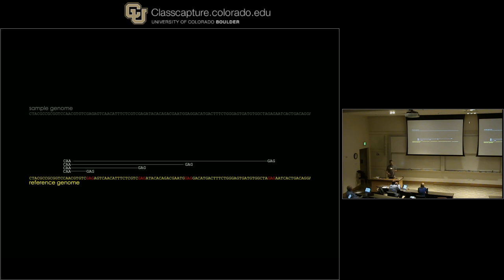And the way that our short-read aligners work is if there is a repetitive sequence where some fragment can align equally well to each of these, the aligner picks one of them randomly and sets that as the aligned position. So you're actually likely to get this type of alignment from this type of sequencing. So the end result is we are still quite bad at detecting structural variants, especially when we compare how good we are for detecting small variants like SNPs and indels.